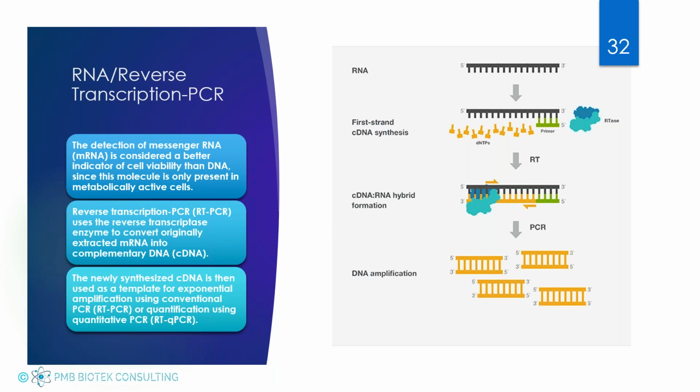Again, this, to me, is like sequencing, where this and the droplet digital PCR are probably 5 years away from really being employed by cannabis labs.